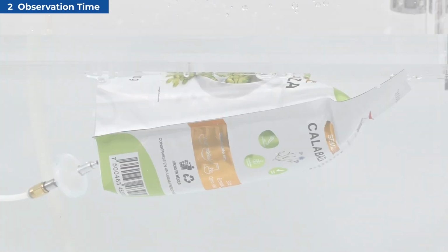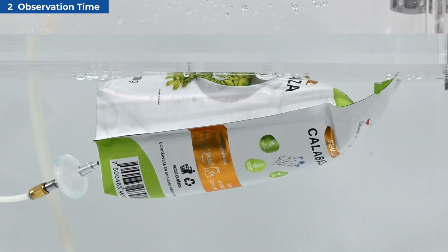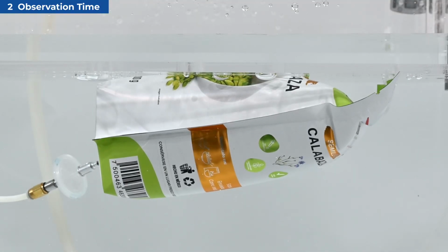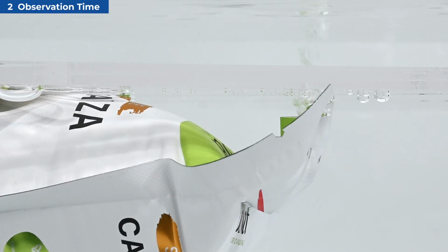In addition, some packages may change behavior under internal pressure. They may inflate, tension the seals, or even slowly open along the seal edge. It is important to define a reasonable maximum observation time and avoid interpreting delayed mechanical behavior as a true leak.